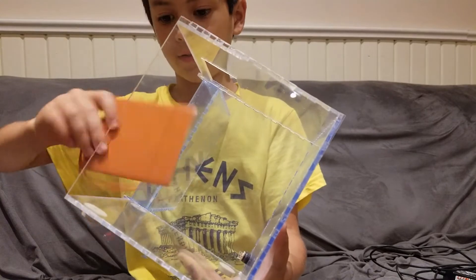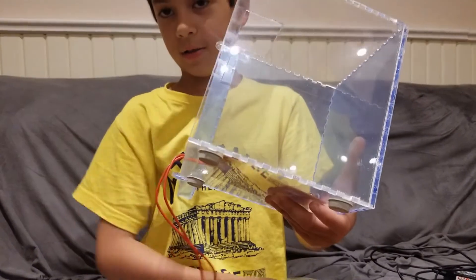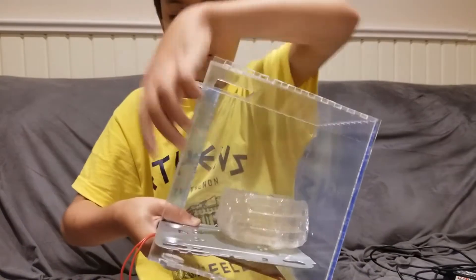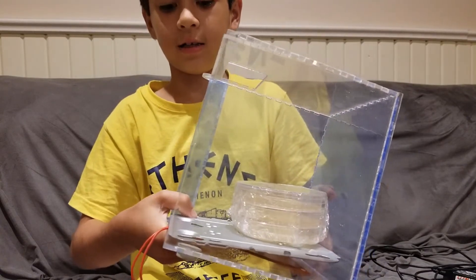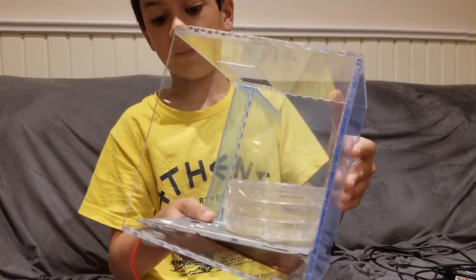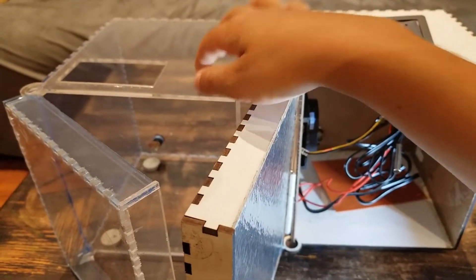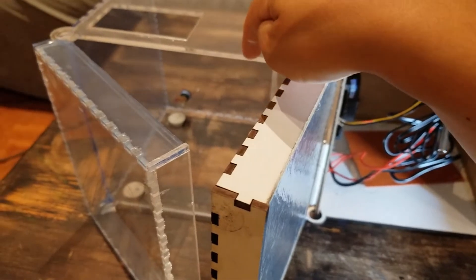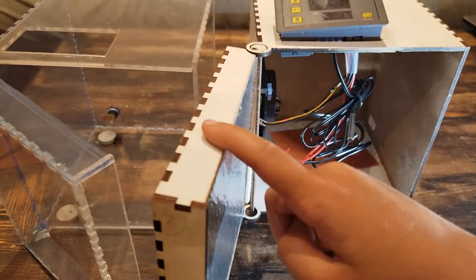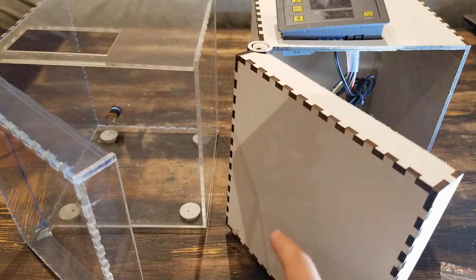We put the heat pad right here, and we don't want it to melt the petri dishes, so we put the piece of metal on top. You could also put legs on it so it's not right up against the pad. You can choose between two box options: one made of MDF and another made of acrylic. The acrylic one is more expensive but transparent. The MDF one is about seven dollars cheaper, but you can't see through it — though you could add a little window.